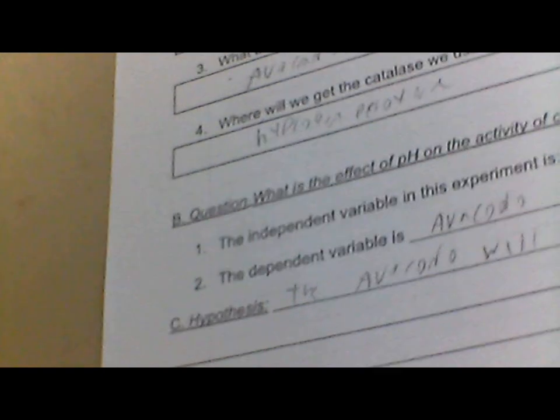Alright. So. Start the lab. Complete the pre-lab. Proceed to step one. Control group. Okay. Alright. Kaden, you're gonna hold this. Measure the pH of the avocado using a pH strip. Record it in the table below. It looks like it's this table. Okay.